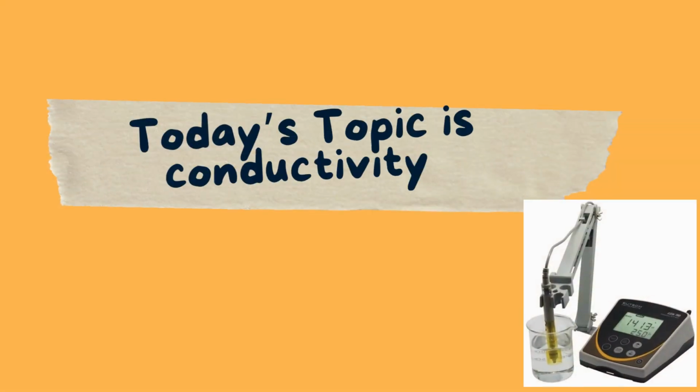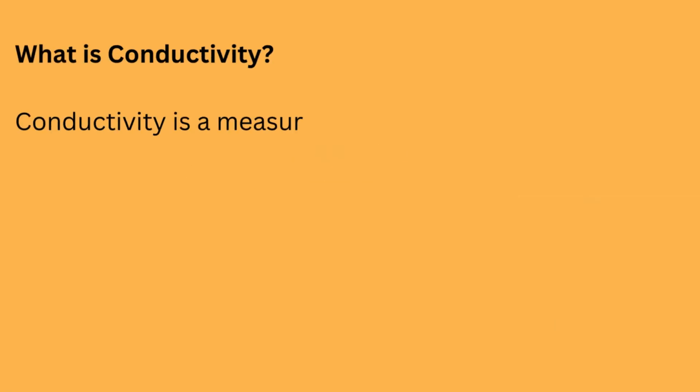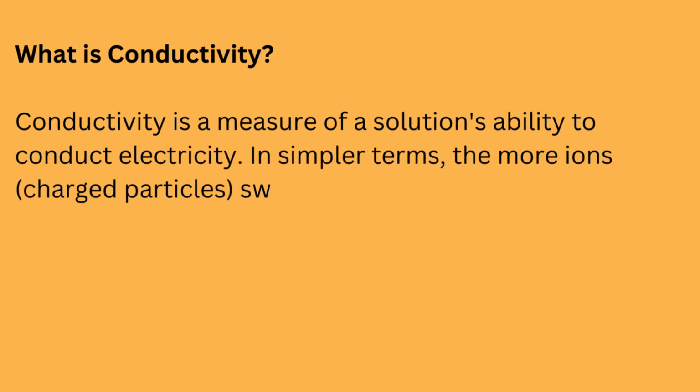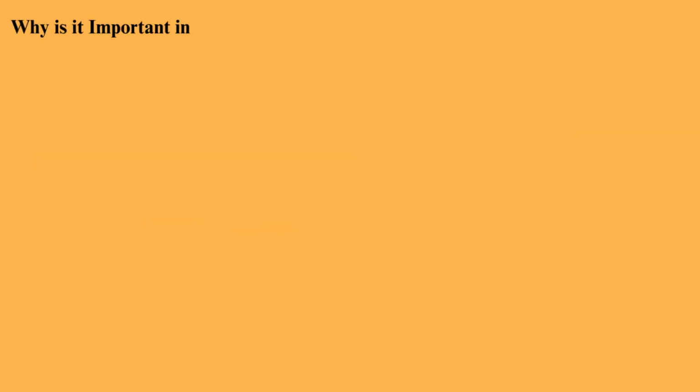Today's topic is conductivity. What is conductivity? Conductivity is a measure of a solution's ability to conduct electricity. In simpler terms, the more ions swimming around in a solution, the higher the conductivity. Why is it important in pharmaceuticals?